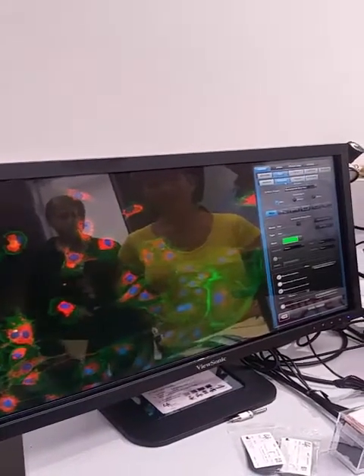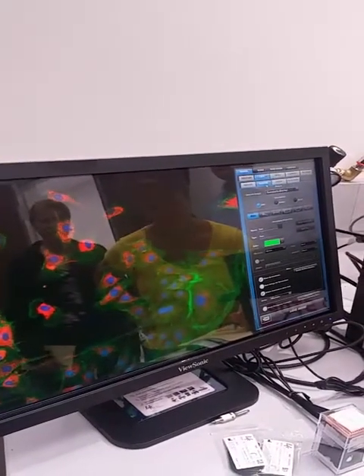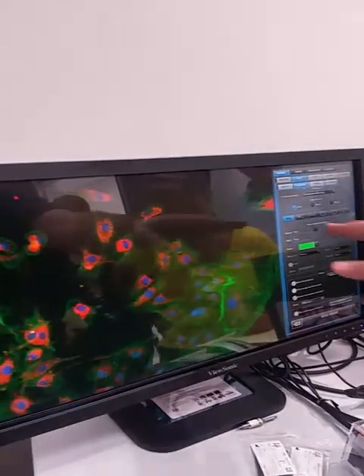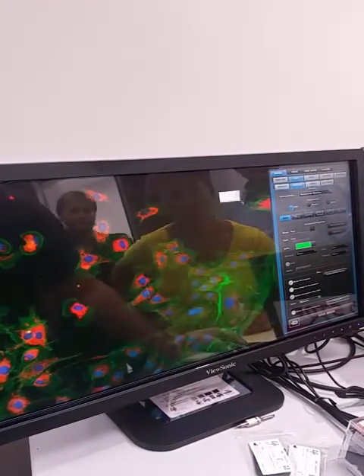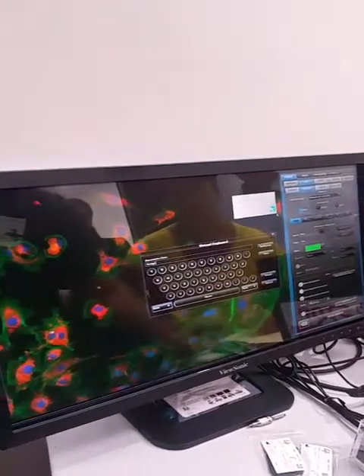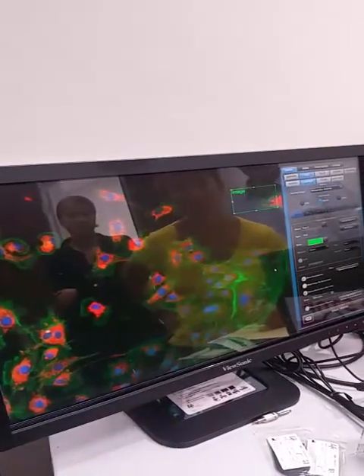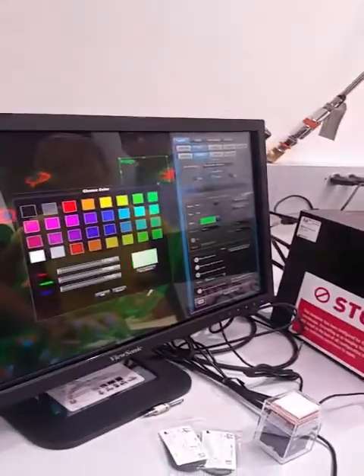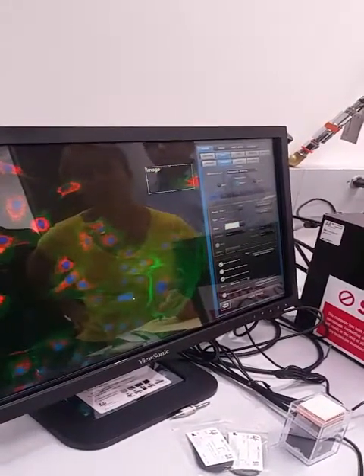Now the next tab is the measure tab. This allows us to create different annotations in the image. The first option is a text box — you can click and drag to create a text box on the image. If you want to change the color of the text, you click your color button, which allows you to change the text color.